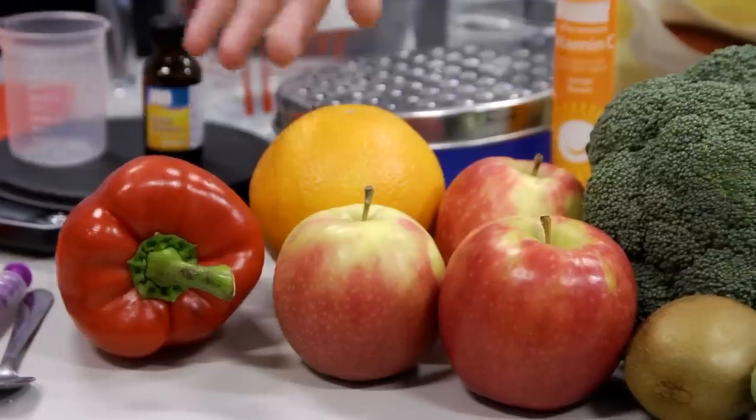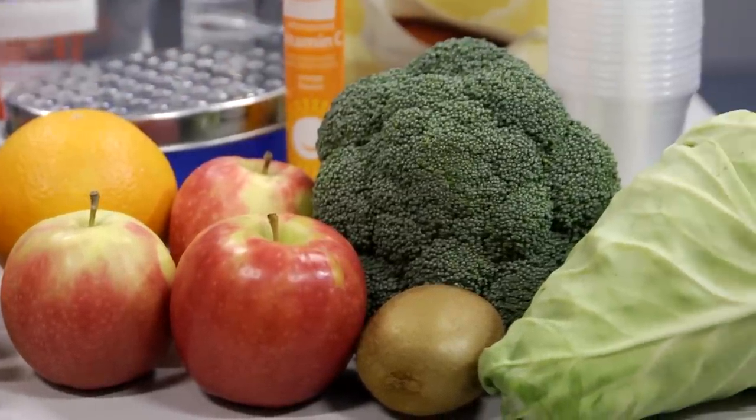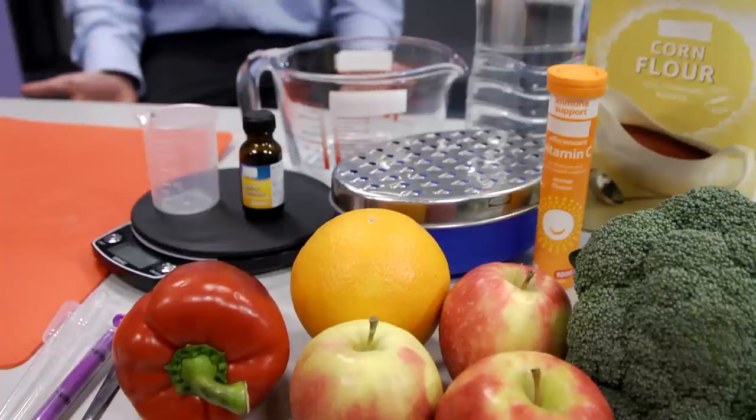Welcome to the Global Experiment 2013 by the Royal Society of Chemistry. In this short video, you'll be shown how to take part by testing the levels of vitamin C in different fruits and vegetables. We've been careful to design the experiment so that you can take part at home or in schools, as it uses non-specialised equipment. Once you've completed the experiment, you can enter your data onto our website to compare with students around the world and see the global picture.